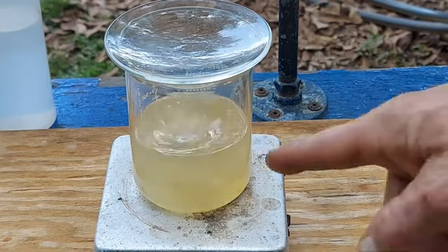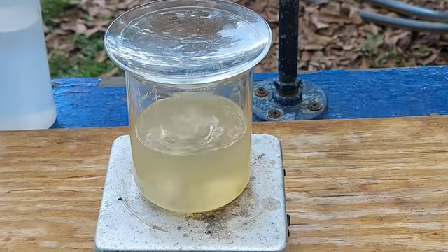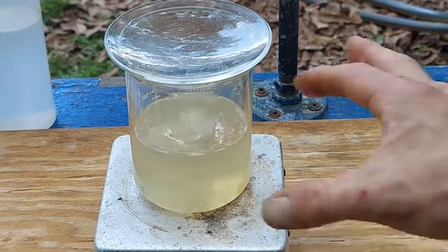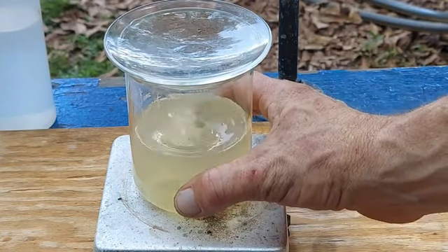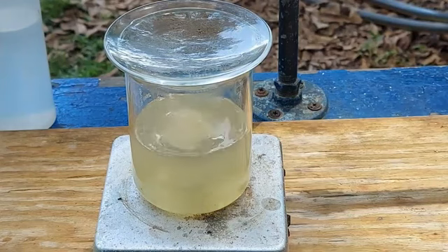Now in this, I added maybe about 25 to 30 mils of that nitric acid. Probably closer to 20, 25. But as you can see, the mercuric oxide dissolves readily in strong heated nitric acid. I've got the heat on. This is still not too hot to touch. It's going to get uncomfortable soon. So as you can see, it does it fairly readily. If we just let this keep going and stirring, we might have to add a little more acid.